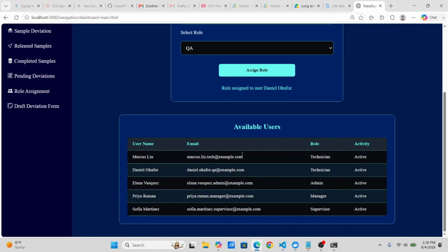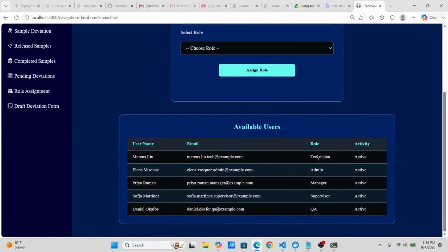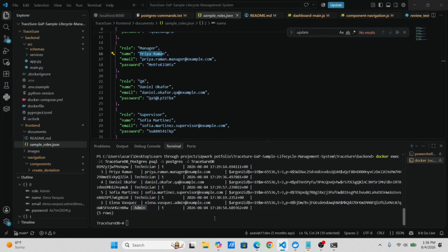Assign. Okay, so let me wait for this to refresh real quick. Okay. Technician, admin, management, supervisor, role. Okay, so we have everyone set.